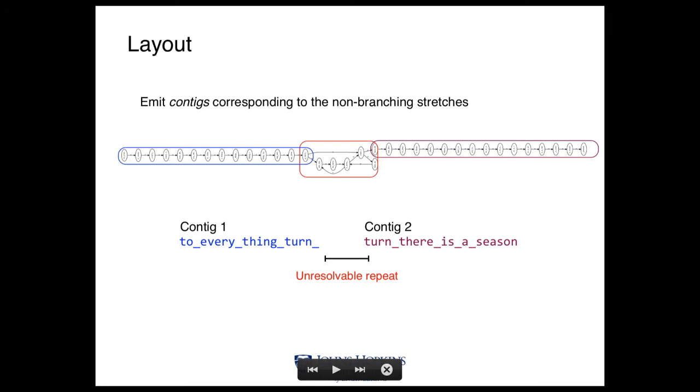Yeah. It's actually not transitive because, although it's hard to see on here, the arrow is pointing into this one, in this direction. If the arrow was on the other side, then it would be a transitive edge. Then you can reselect the contig? Yeah, if the arrow is going here, we could remove it. But because it's going back, it's a loop rather than a transitive edge.